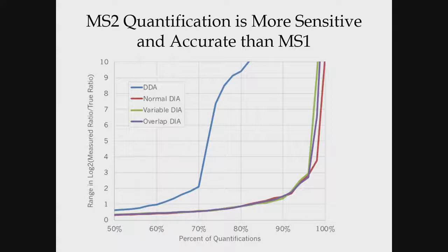That's using the MS1 quant. Yeah, and we have actually lots of data like this now.